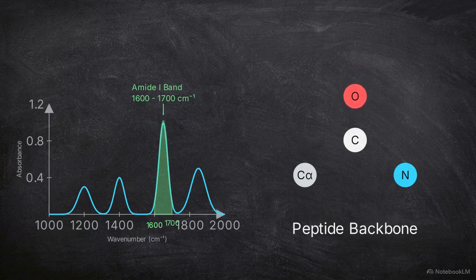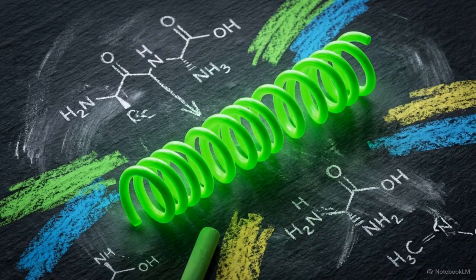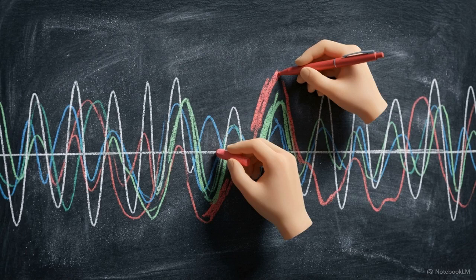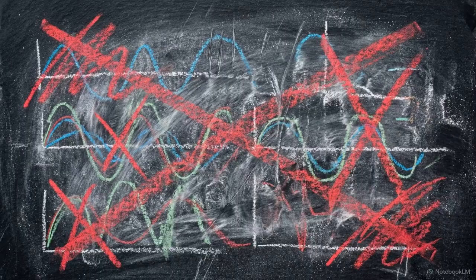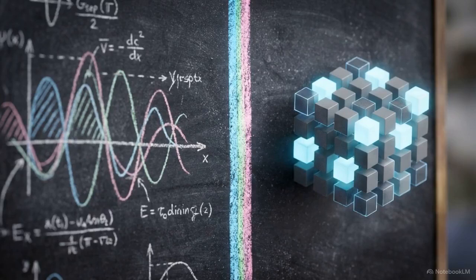This band is generated by a precise physical phenomenon: carbon-oxygen bonds stretching and vibrating along the protein's peptide backbone. The exact frequency of these microscopic vibrations shifts depending on how the protein is folded, dictating whether it forms an alpha helix, a beta sheet, or remains entirely unstructured. Traditionally, human operators attempt to read this band using manual deconvolution methods, but those techniques are highly subjective and easily distorted by background noise. Isolating the amide 1 band physically provides the raw material, but we still need an objective mathematical translation before any artificial intelligence can process it.